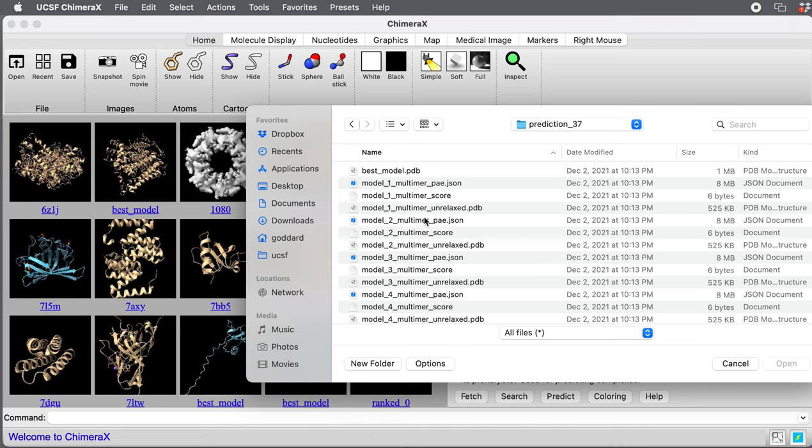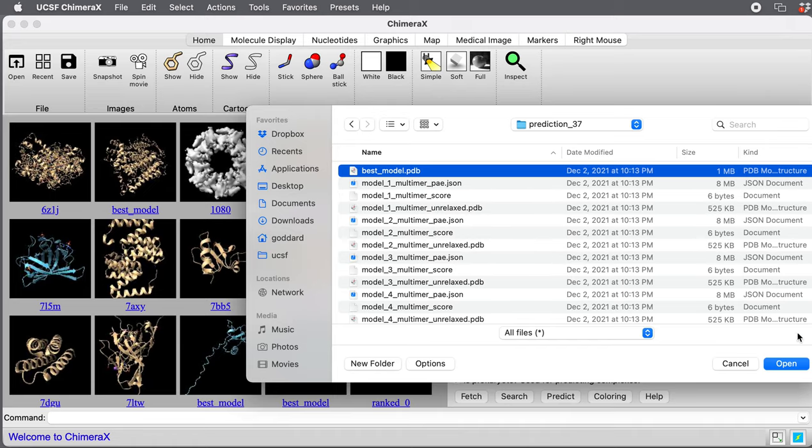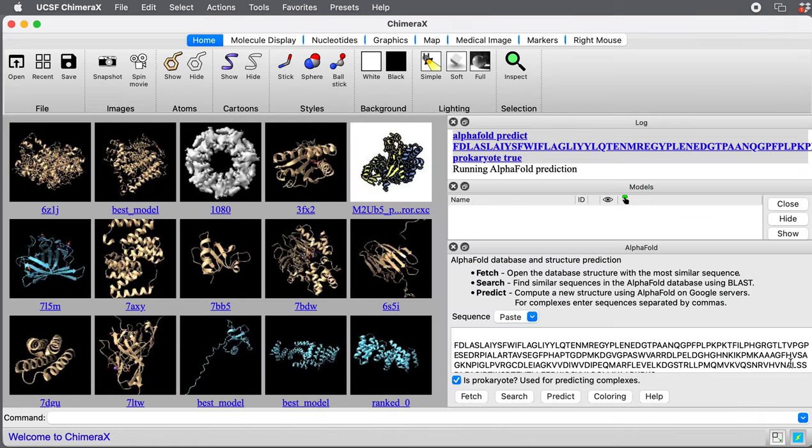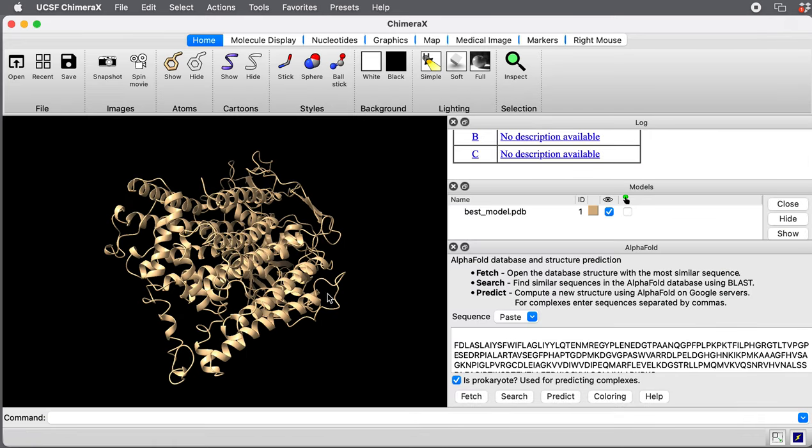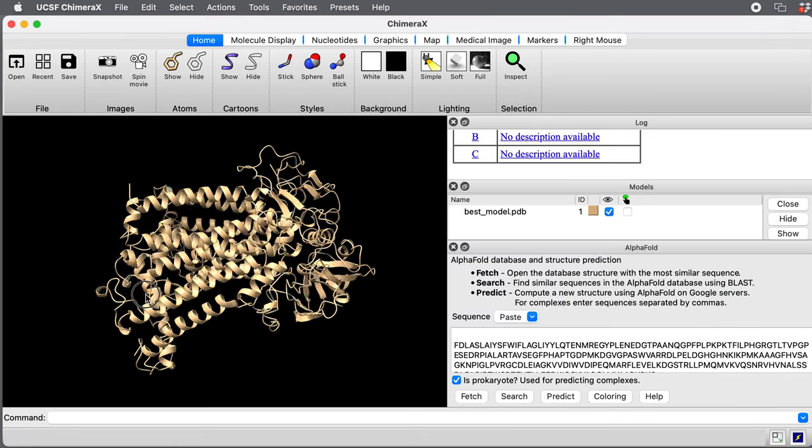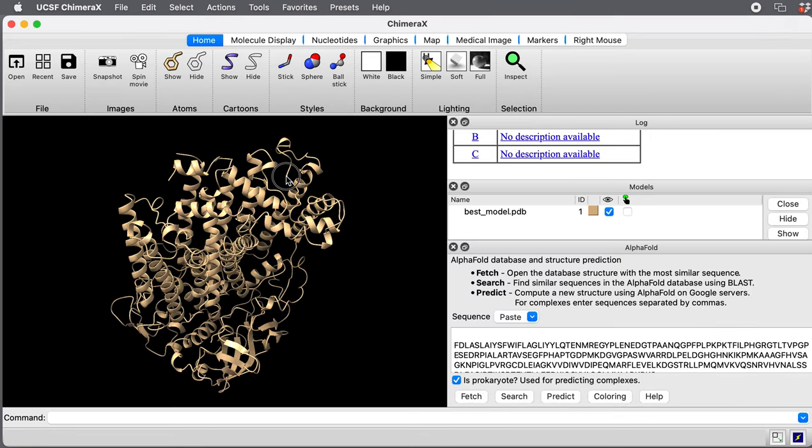In here you'll find the five different predictions it made. And this bestmodel.pdb is the one with the highest confidence score. So I'm going to open that one. Here's what the prediction looks like.